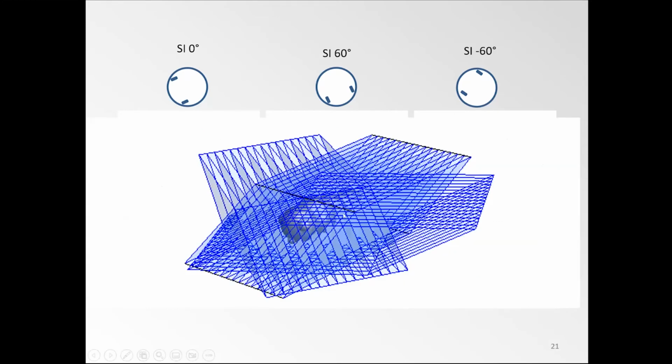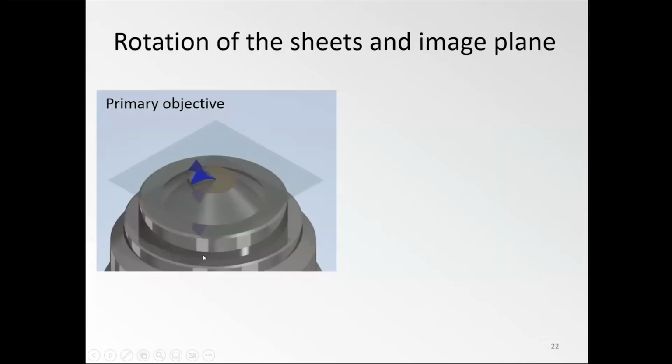And then you can stitch those volumes together, and where they have mutual overlap, you could do a reconstruction, a SIM reconstruction that is kind of isotropic in all lateral directions. Okay, so this is how it looks as it comes out of the objective. So these two light sheets that interfere with each other, we rotate them by 60 and 120 degrees. And you could imagine it like a TIRF system with spinning illumination. So this is kind of a similar idea. You just spin them in the back of the pupil. And so also in real space, they change their azimuthal angle.